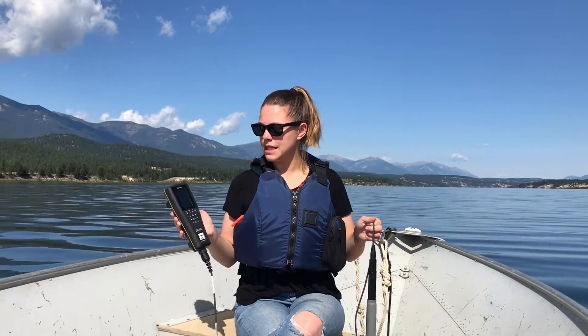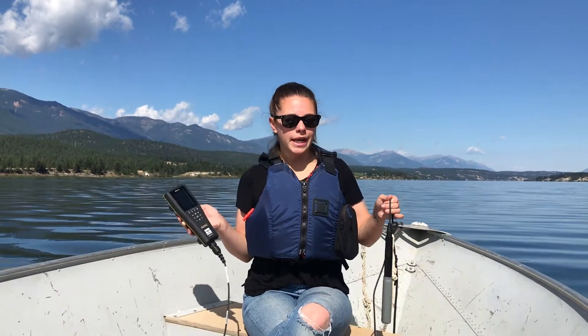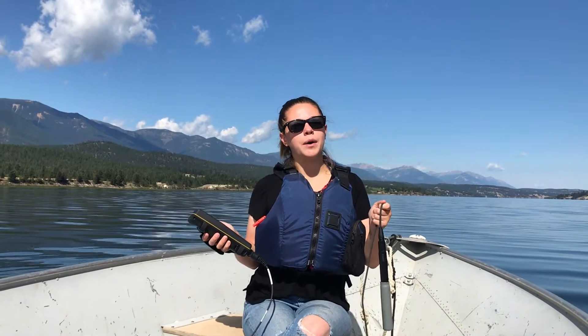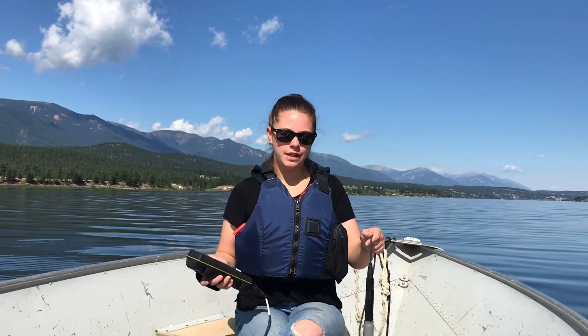Our next piece of equipment is the YSI Pro Solo. This piece of equipment measures three different parameters: temperature, dissolved oxygen, and specific conductivity.